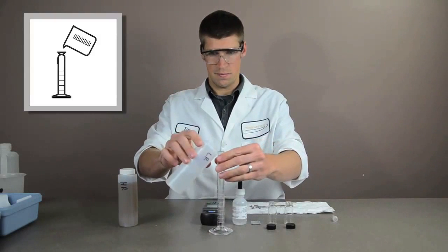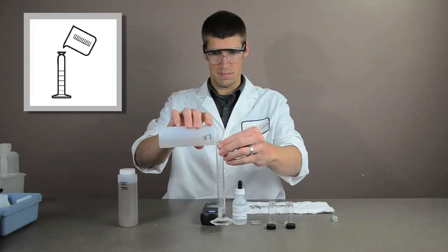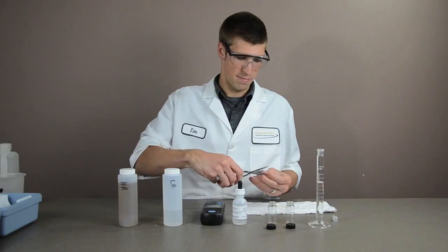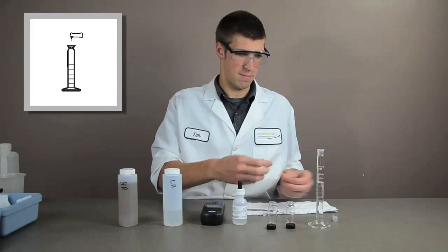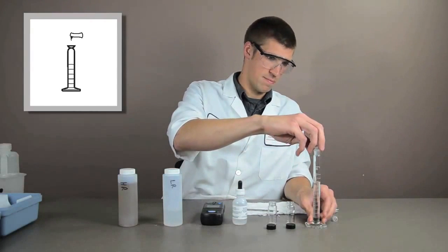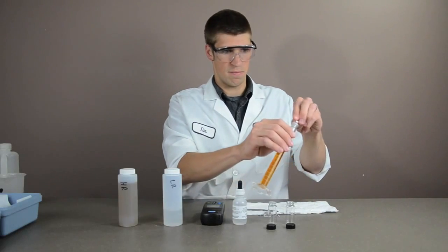Fill a 25 milliliter graduated cylinder to the 20 milliliter mark with sample. Add the contents of one molybdenum 1 reagent powder pillow to the cylinder. Stopper the cylinder and invert.